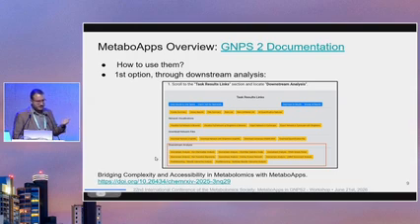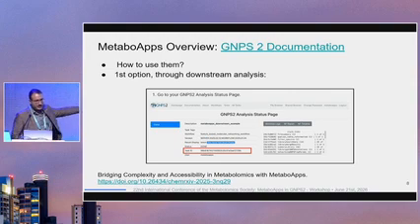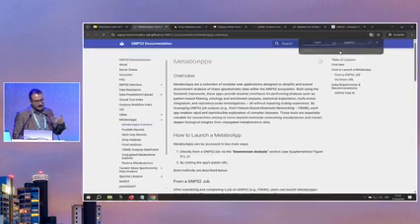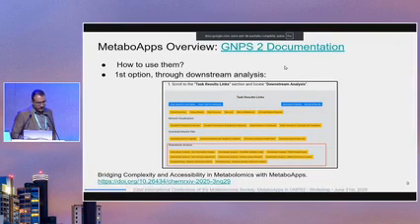That's the first thing. When the job is done, as I showed here, you're going to get a task ID from the platform. So for that data set and those specific parameters you selected, that's going to be the identification for you to use in any of the tools that we're going to discuss right now, the first one being the drug readouts.